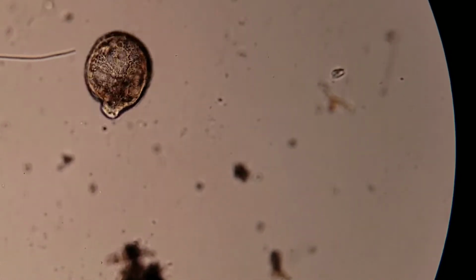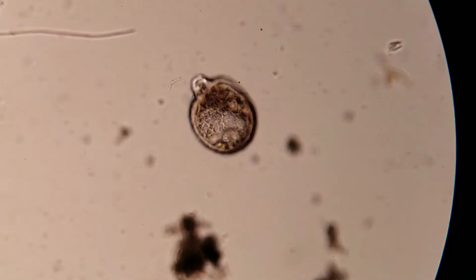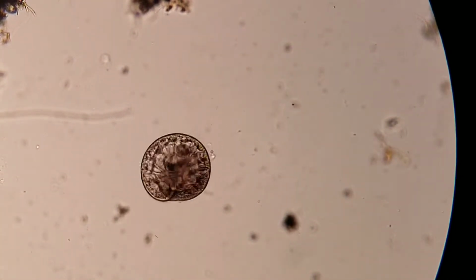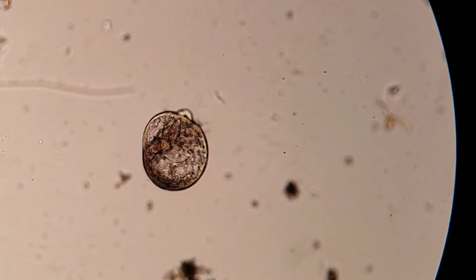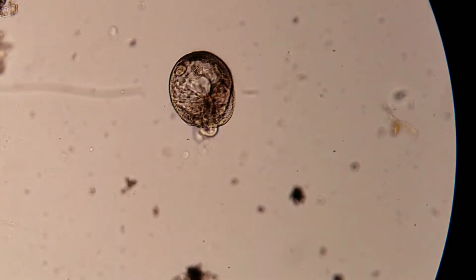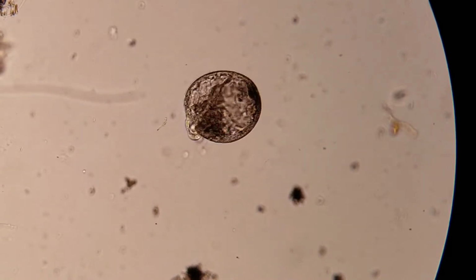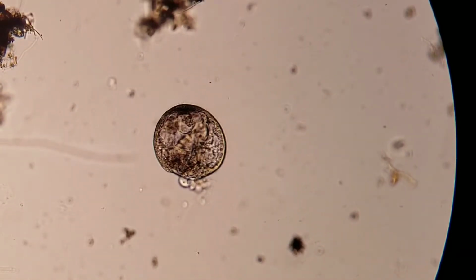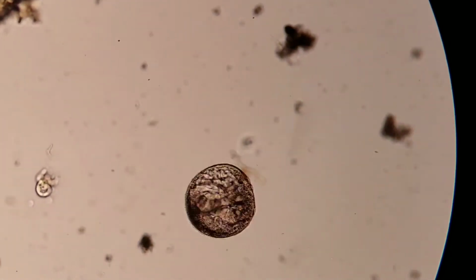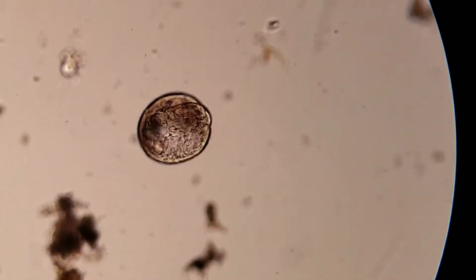Try to fix the light here. Well, the lighting is okay. He's a little, oh, he's changing shape almost. This is neat. Wow. See little hairs along his edge, along his perimeter, making him spin. But I think he also sucks in water and pushes it out. I can see his ciliates. Little tiny hairs.